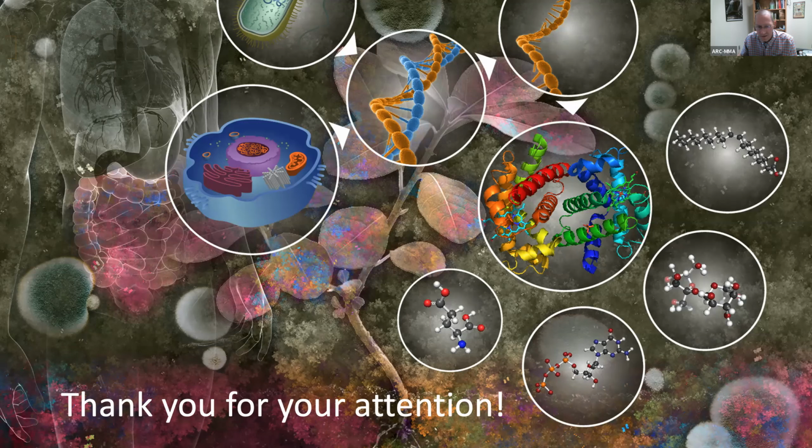I particularly found it interesting just looking at the picture of your biphase, the MPLEX prep on real soil, and seeing that protein layer that frankly looks like soil. Yes. It was pretty striking. It's messy. Soil is messy, and it takes time, it takes effort, it takes practice. It's not something that you're going to get right away, but you just have to keep at it. A lot of it is trial and error, and a lot of it is what works in your lab with your methods and your hands. So even if you follow someone else's protocol, it might not still work the same. You just kind of have to try different things and be creative.